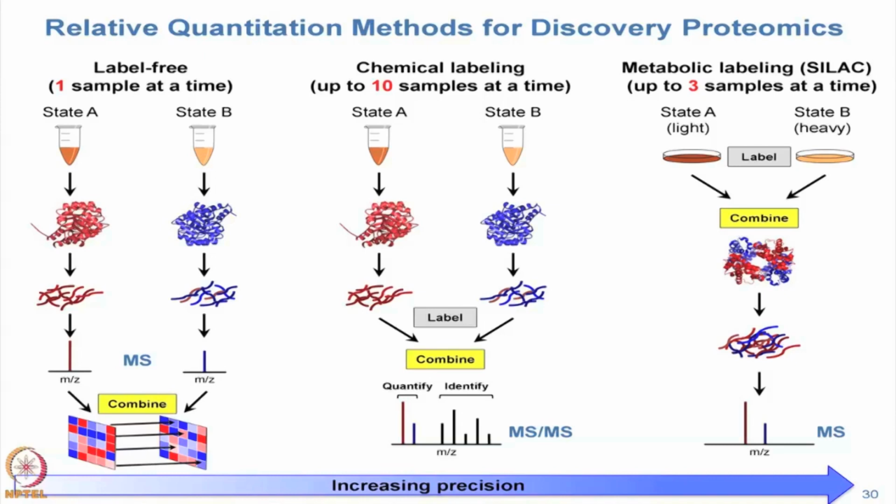If you have an iTRAQ reagent, there are actually two iTRAQ reagents. One's called iTRAQ 4 and the other one's called iTRAQ 8, so that tells you how many samples you can put together. There's also something called TMT-6. I will get into some of the differences in what you have to be able to do those kinds of experiments. So here are some of the features.